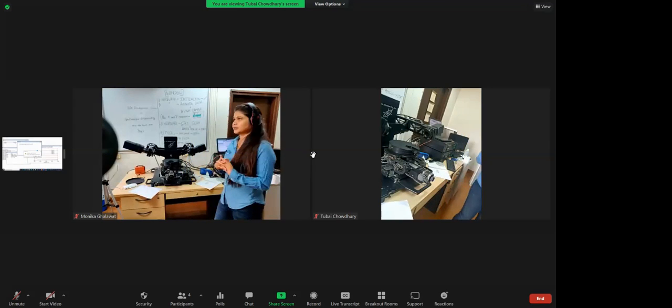I can show how you can do your own samples. But for a model demonstration, if you want me to go for a very new sample, which is not reported or does not have a model till now, sorry, we are not able to do that. But yes, you can do it by making your own model, and I can help you in this way: I will just explain how you can do that.